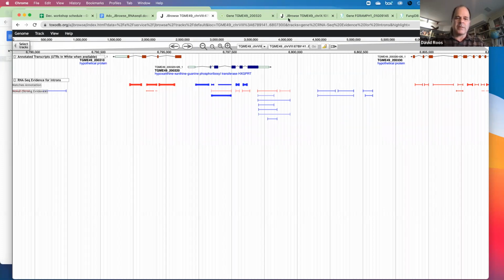This is a common type of intron polymorphism, an exon skip polymorphism, suggesting that there are transcripts that excise all 5 of these introns, but even more commonly, an intron that completely deletes this intervening exon.